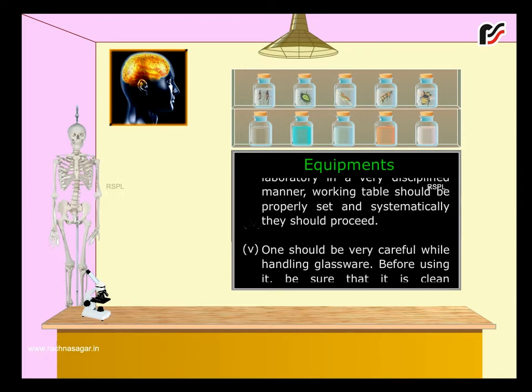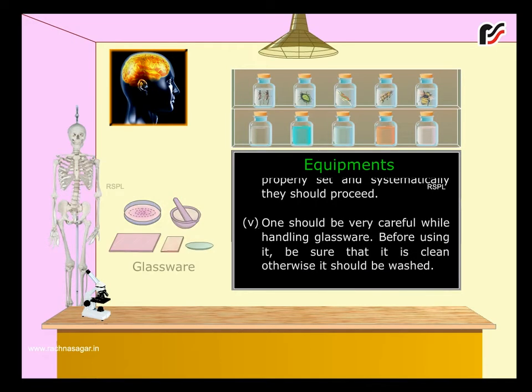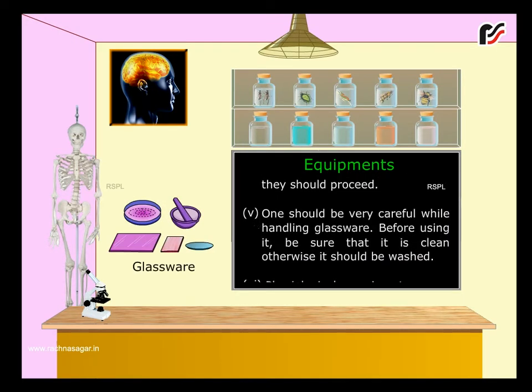One should be very careful while handling glassware. Before using it, be sure that it is clean, otherwise it should be washed.